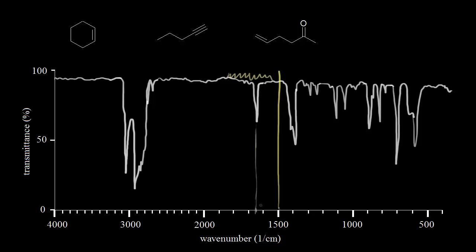So we'll say approximately 1,650. That's not very strong. Both of those things, the location and the fact that it's not a very strong signal clue me into the fact that this is probably a carbon-carbon double bond stretch. That's what this is talking about here.